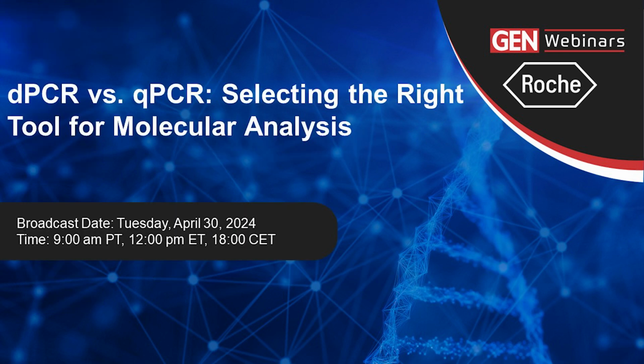We're going to discuss the dPCR workflow and the technology's advantages over traditional qPCR, including its higher precision, flexibility, sensitivity, and true absolute quantification. We'll also go over some of the differences between the technologies, including the resources and equipment that are needed to perform dPCR experiments and some of the pitfalls that you should look out for. Our discussion will also include types of applications that are best suited for the technology.